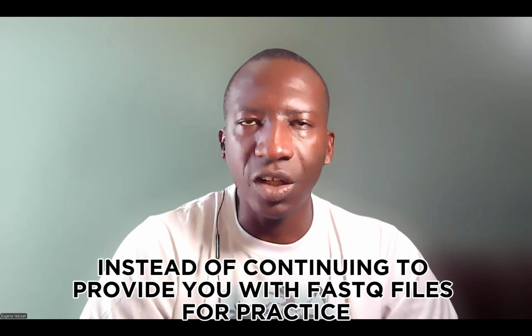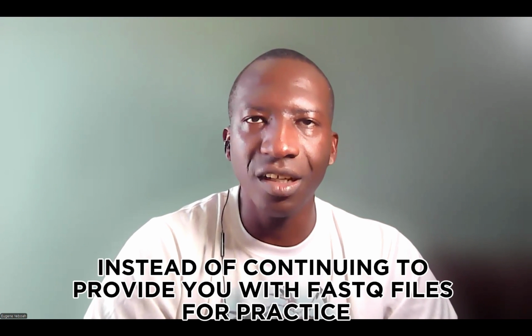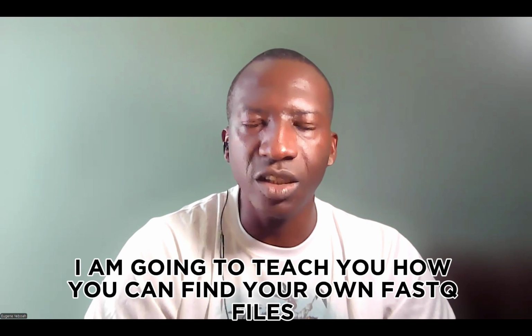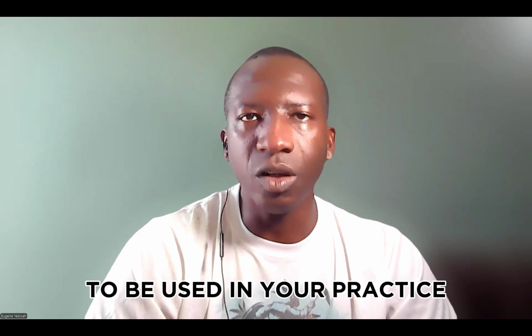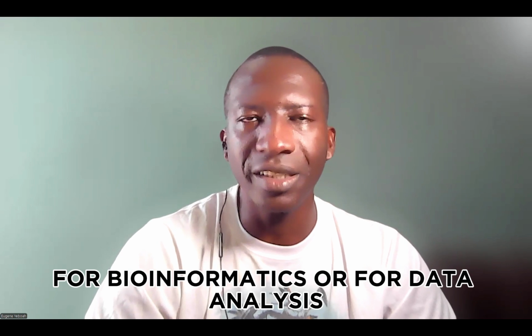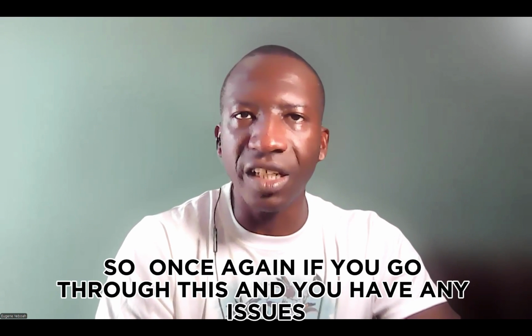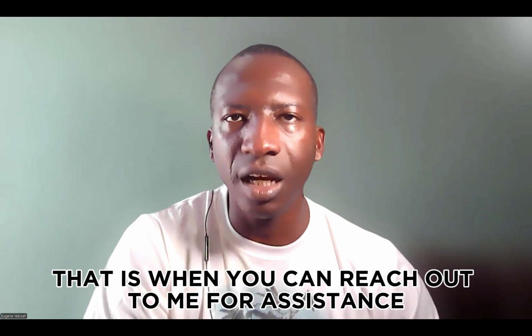So instead of continuing to provide you with fastq files for practice, I am going to teach you how you can find your own fastq files to be used in your practice for bioinformatics or for data analysis. And once again, if you go through this and you have any issues or you're not sure what you're looking at, that is when you can reach out to me for assistance.